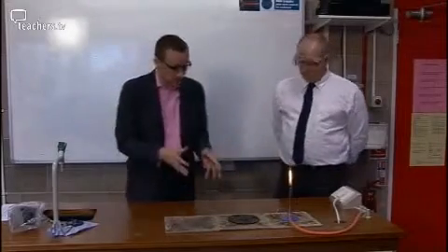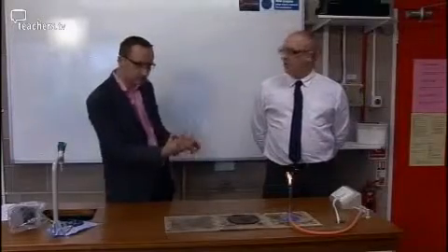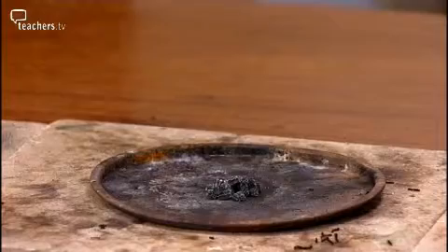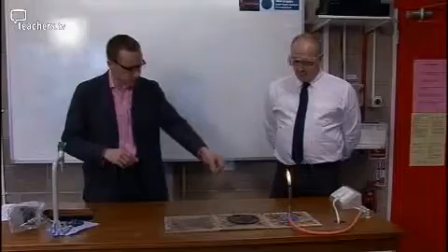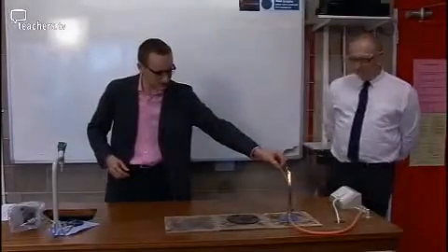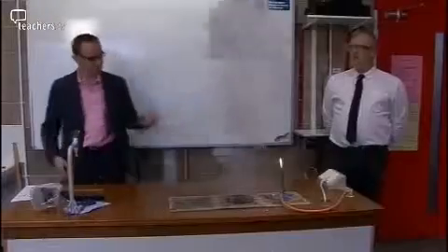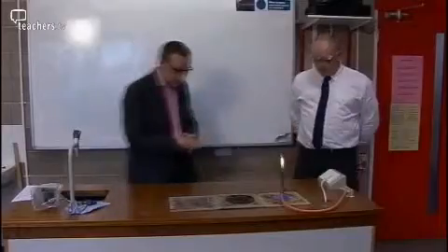I've actually brought in some commercial gunpowder here. That's about the quantity that we need to use — it would fit on a beer bottle lid. It's probably best to do this in a fume cupboard, but obviously we want to be able to see it here. I'm just doing it with a small amount. Flame to the end of it. Nice — lovely, isn't it? Not plenty of smoke, and it's that whoosh. And a nice purple flame there. That's showing us it's potassium — potassium nitrate, which is our oxidising agent. Of course we've got sulphur and we've got carbon in there as well.